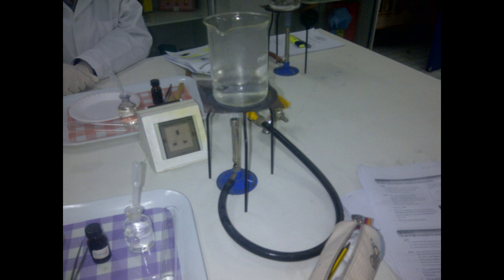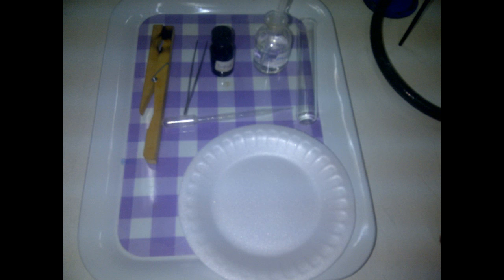For the four experiments, the apparatus needed are a beaker, water, Bunsen burner, a test tube, a test tube rack, two droppers, iodine, alcohol, and a white tub.